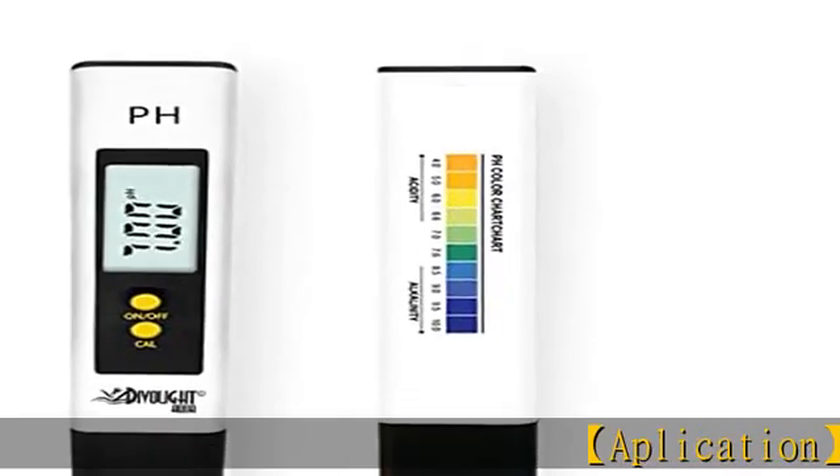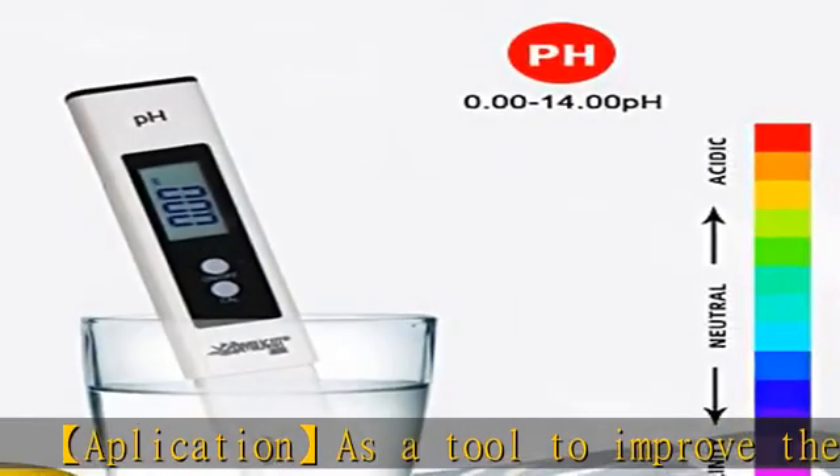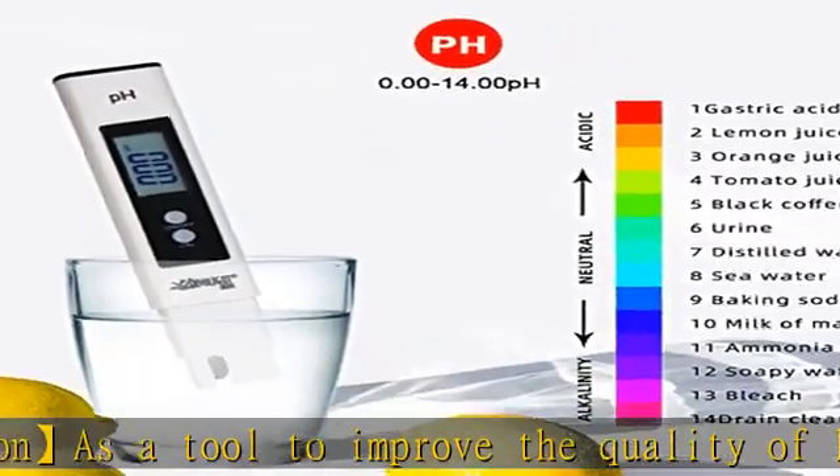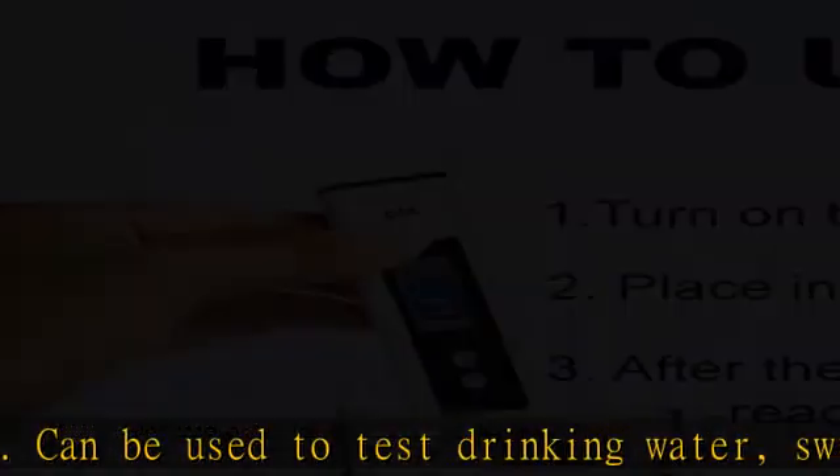This application is a tool to improve the quality of life. It can be used to test drinking water, swimming pools, pH balance in an aquarium, RO systems, spas, or hydroponics — all the environments that need to test pH values.